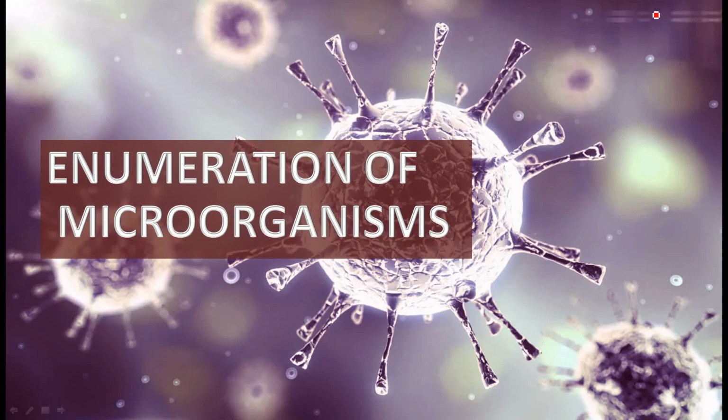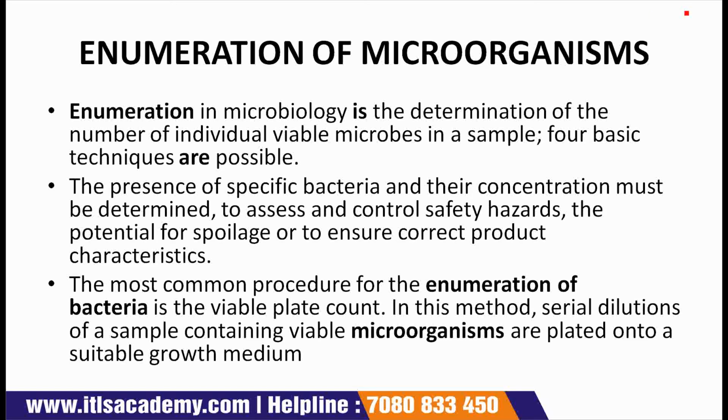Our today's lecture is Enumeration of Microorganisms. First of all, we will see what is enumeration of microorganisms. What does it mean? So the very first point is, enumeration in microbiology is the determination of the number of individual viable microbes in a sample.